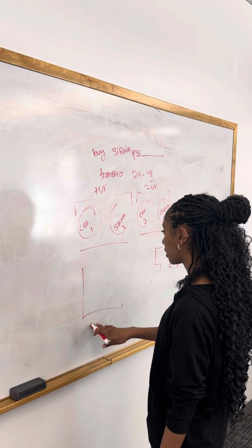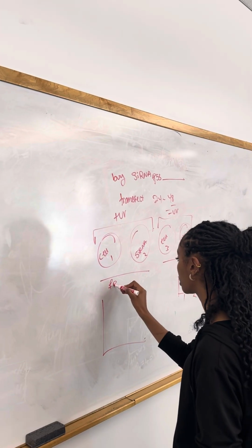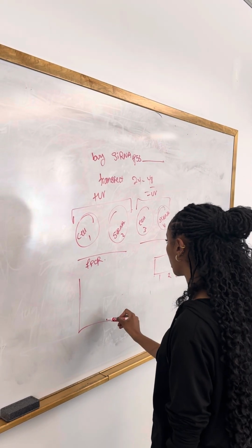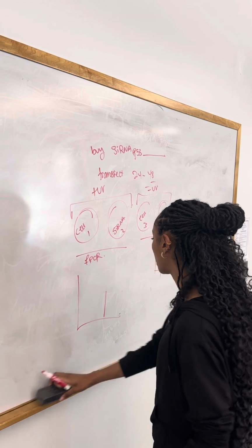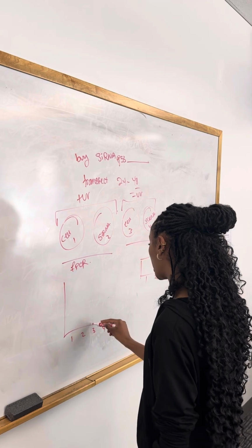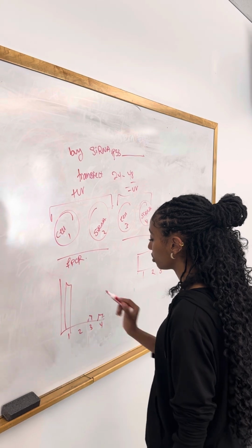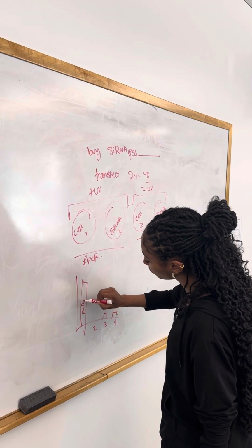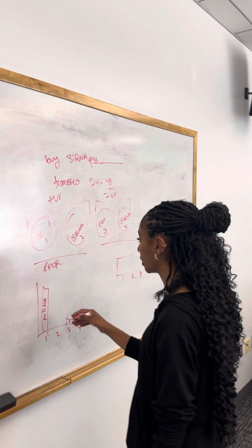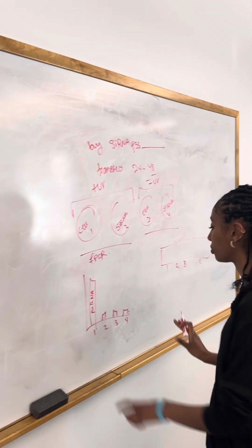Okay, so when we're measuring for the P53 here, when we do the qPCR basically for the RNA, we shouldn't see any mRNA for 3 and 4 anyway. I mean, I can put a little amount, but we shouldn't see much because there's no damage in the cell. And then on the first one, we should be able to see a good amount of mRNA here. For the second one, however, because we added siRNA to it, we should see a small amount, or not at all, but this would be the qPCR.